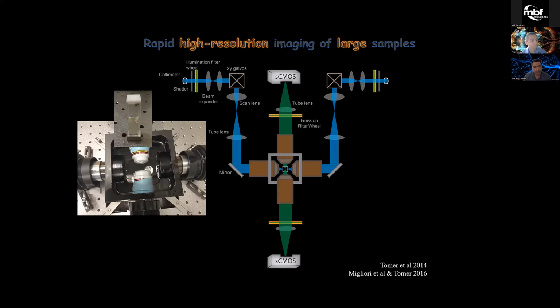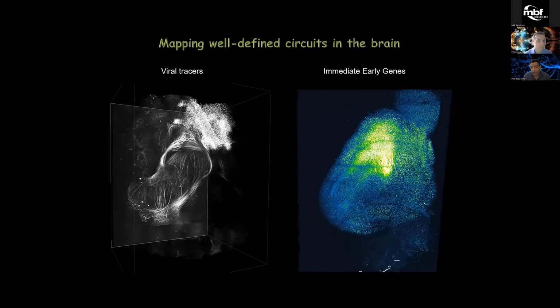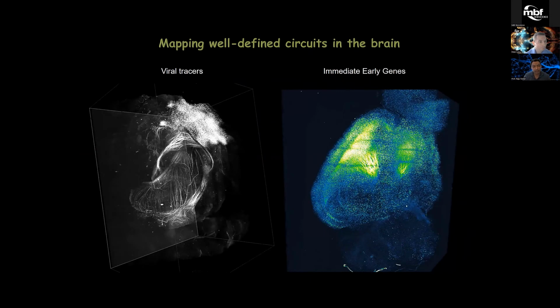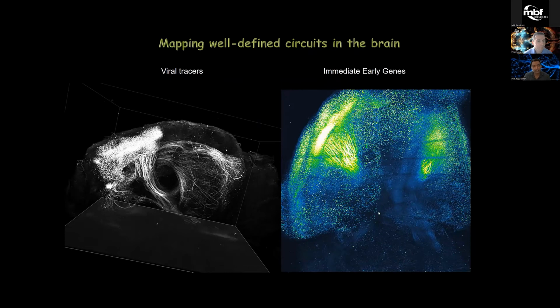also work out other strategies like adaptive parameter correction, so that we can correct for any deviations between the light sheet and the focal plane alignment that may result because of the large depths that we are trying to image. So that allowed us to do high resolution imaging of mouse brains or samples of similar size that are cleared. So here are a couple of examples from our work.